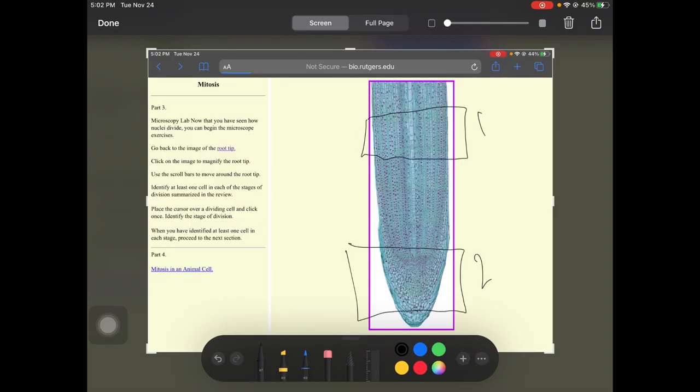So we're just going to count. And to count, we're going to do it systematically. We're going to go down one row and up the next. So we're not just counting randomly. We're going to make sure that we're counting in some kind of systematic way. We also want to make sure that we're staying in the area that we intend.